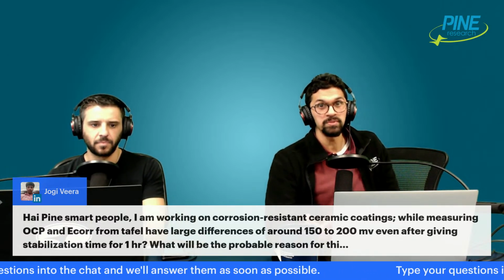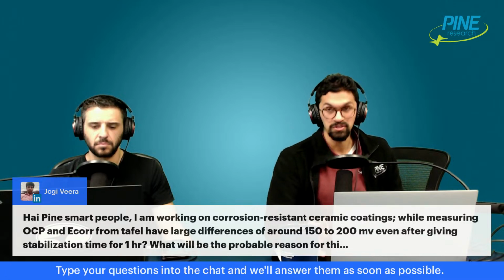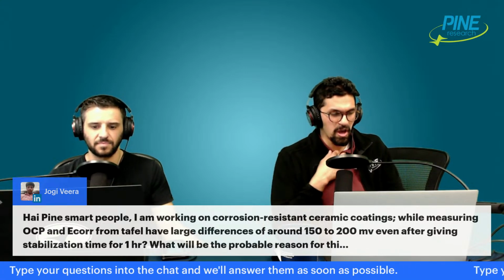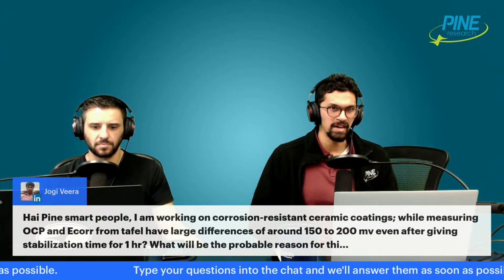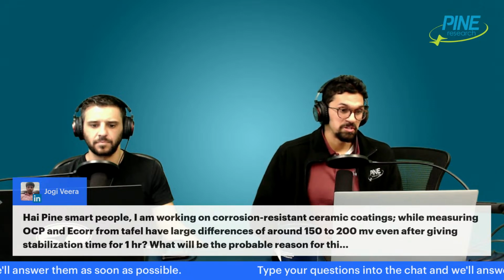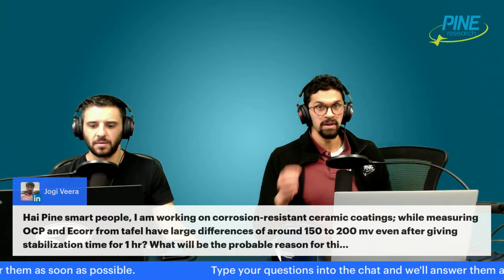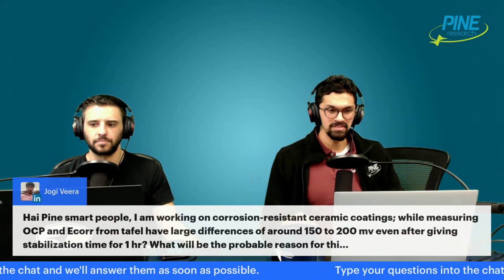And then someone said that the open circuit potential is really the equilibrium potential, but the corrosion potential, because it's corrosion, is not technically at equilibrium because it's corroding. So from that thought process, it's okay to have a difference between the open circuit potential and the Ecorr, because they kind of represent two different things. The open circuit potential is when no current is passing through your electrochemical system. It's only a tiny current because you have to have a small current when you're making a measurement, but it's negligible considering the scale of things.